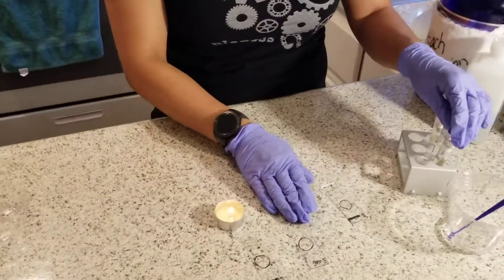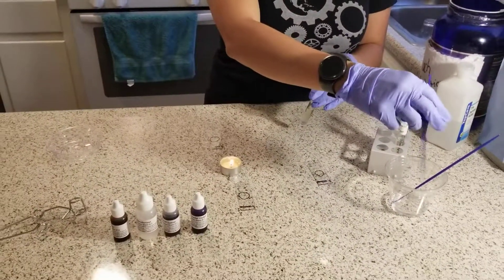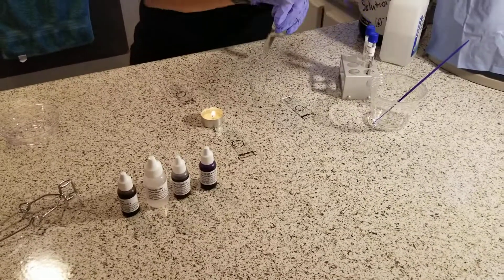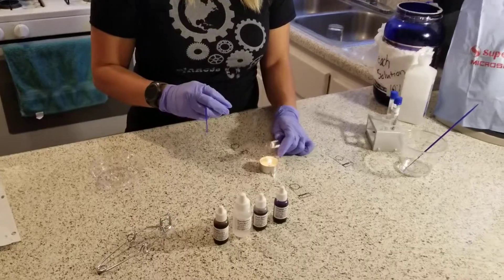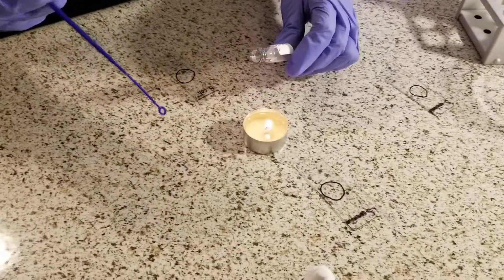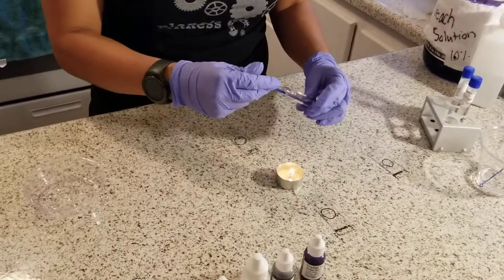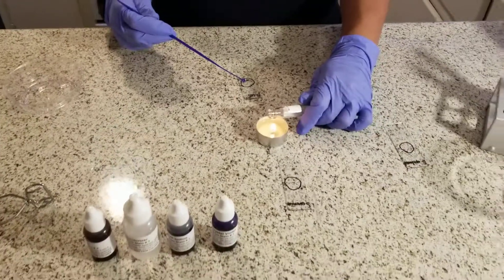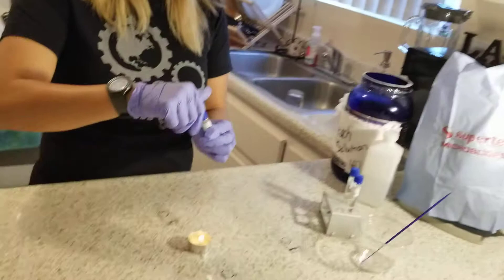I'll move on to my next bacteria, which is the E. coli. Again, with the inoculating loop, let it dry. Then I will take the broth and pass it over the flame to sterilize the lid and prevent contamination. Then I will inoculate the broth and transfer the bacteria onto the slide. Then, with my broth, I will once again sterilize the lid and recap. Then I will dispose of the inoculating loop in the bleach solution.